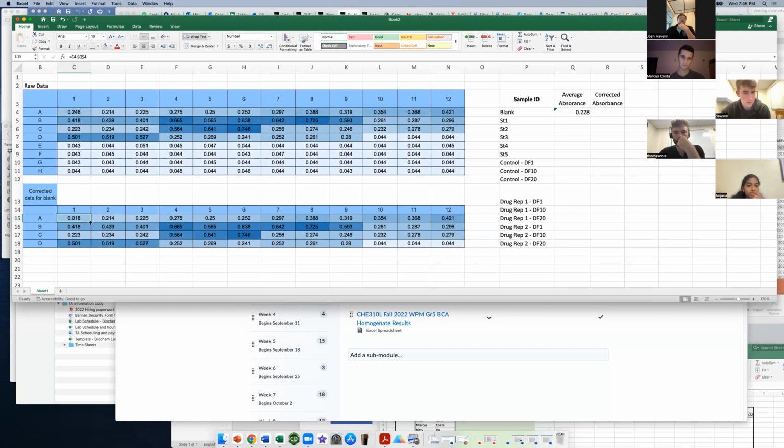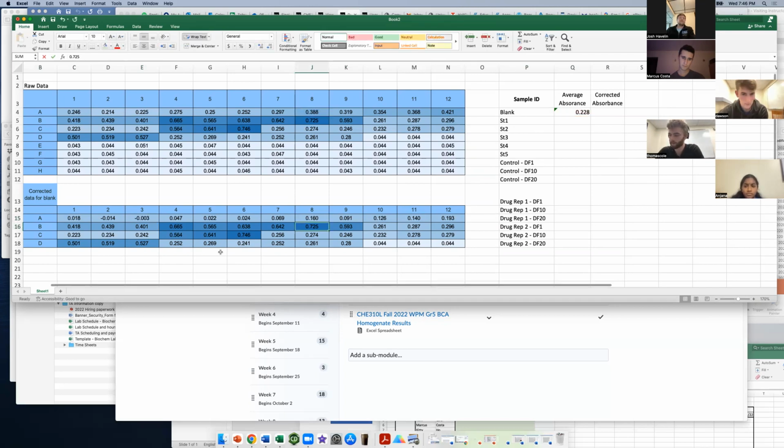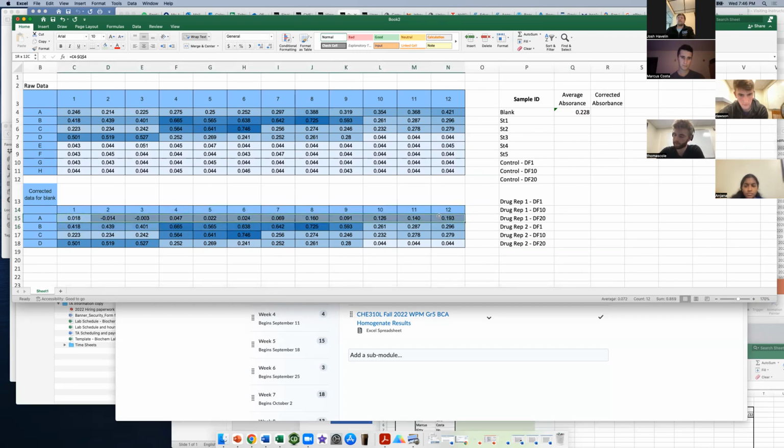So now if we grab the bottom right and scroll over, all these cells are now subtracting this from their corresponding cell ID. So if I double click here, now it's saying this cell minus the locked cell, this cell minus the locked cell. And all the way over here, this cell minus the locked cell, right? Any questions about that? Do you just do it for every row?